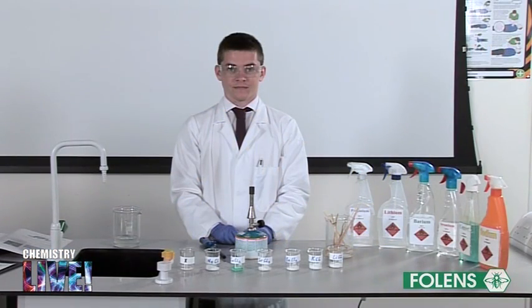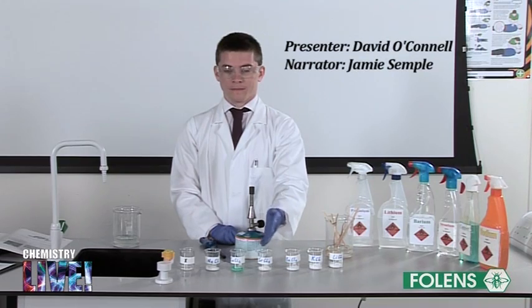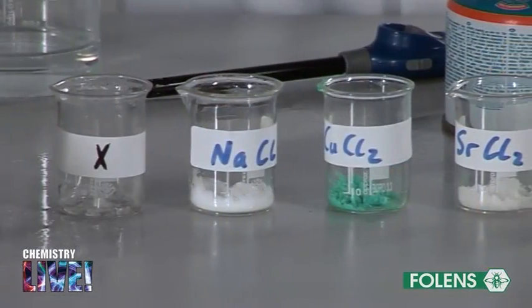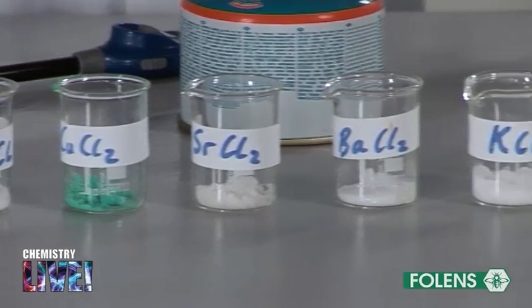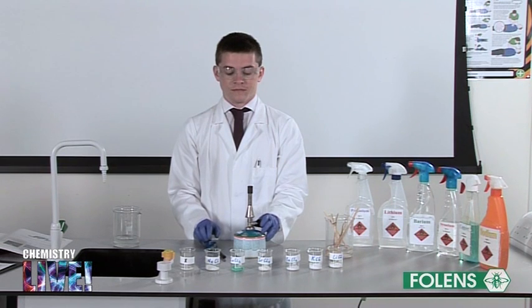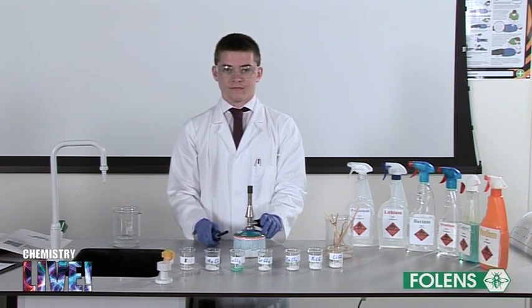Experiment to carry out flame tests with salts of lithium, sodium, potassium, barium, strontium, and copper. In this experiment, we will study the colors given off when salts of certain metals are heated in the flame of a Bunsen burner. The colors obtained can then be used to identify the metals present in an unknown compound.